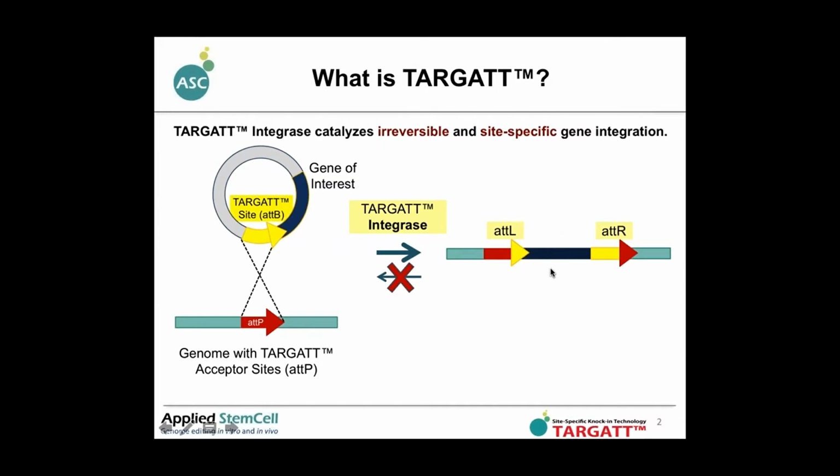These two new sites can no longer be recognized by integrase. Therefore, integrase catalyzes an irreversible and unidirectional reaction, increasing site-specific gene integration efficiency.